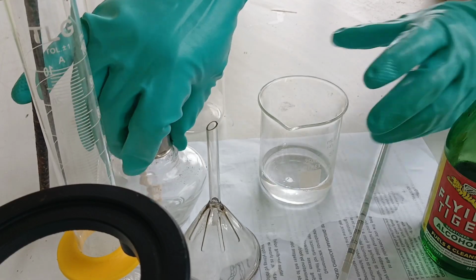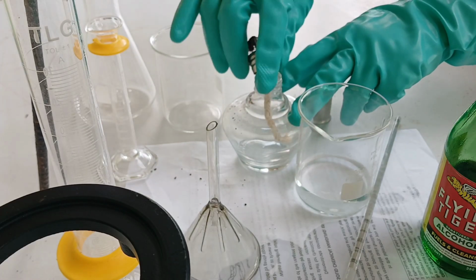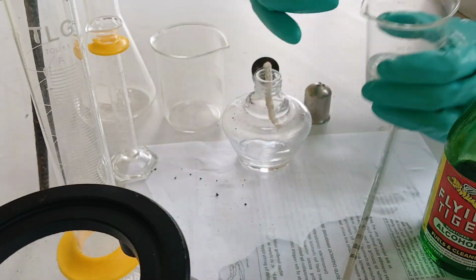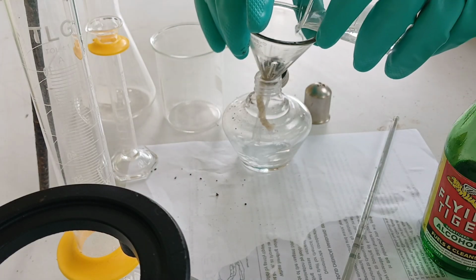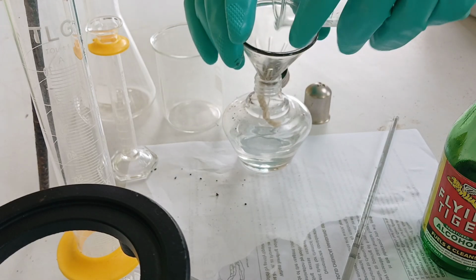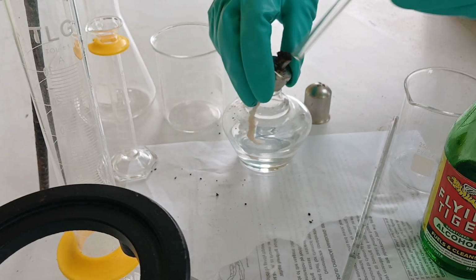Imagine that's upside down, and say for example you're trying to transfer that denatured alcohol to the alcohol lamp. The alcohol lamp is a narrow mouth container. Of course, do not pour it directly, it will cause spillage. Use another pouring guide, a funnel. With the funnel, there is no spillage at all, free from any spillage or dirt that would be created on the table. So just like that, as simple as that.